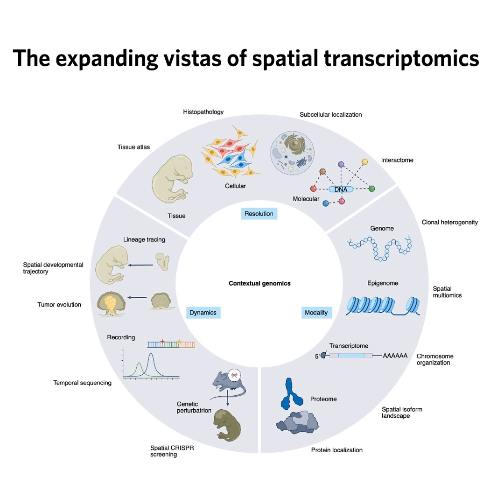It is. But here's another crucial detail that makes methods like MERFISH work so well. They don't just use simple binary codes. They use mathematically designed Hamming distance-corrected, error-robust codebooks. Okay, what does that mean in simple terms? Think of it like a super robust ID badge. It has enough redundancy built into the code itself that even if there's a mistake in one of the imaging rounds, maybe a spot doesn't light up when it should have, or a wrong spot appears, the system can often still uniquely identify the molecule and correct the error. It can tell that 01011 was supposed to be 01001. This dramatically improves the accuracy because inevitably, things sometimes go wrong during one of those many imaging rounds. That makes the whole system incredibly resilient to noise and error.